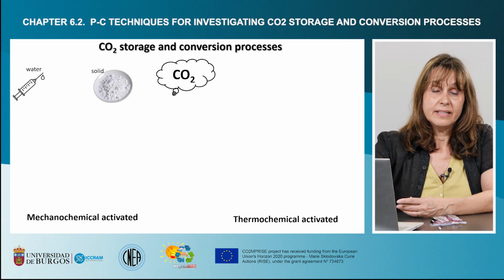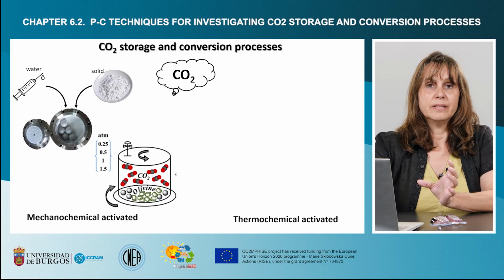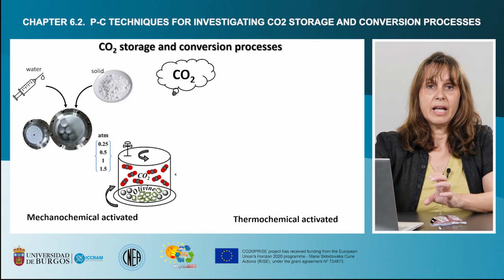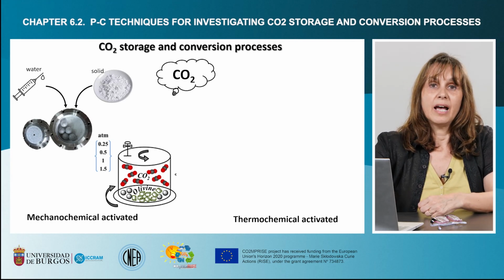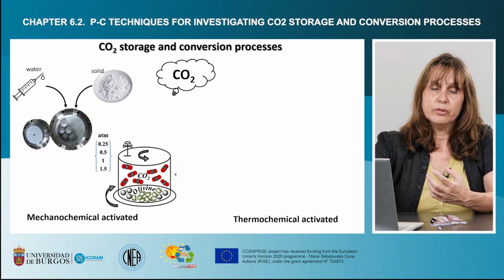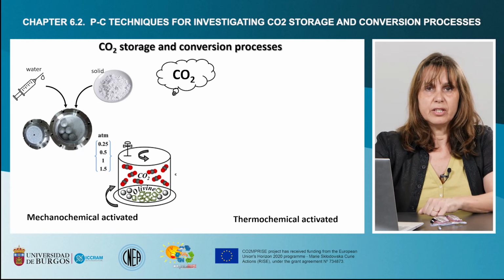In the first case, the reaction occurs inside the reactor, which is the milling chamber. The solid is put inside this milling chamber and placed in contact with carbon dioxide gas at high pressure, and by the action of the moving balls in contact with the solid, by impact and friction, the reaction can occur.